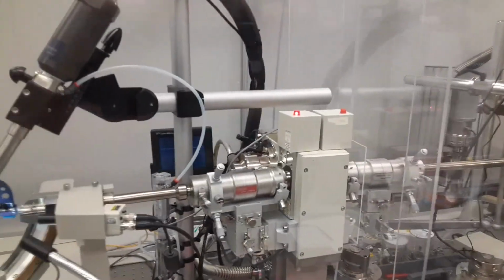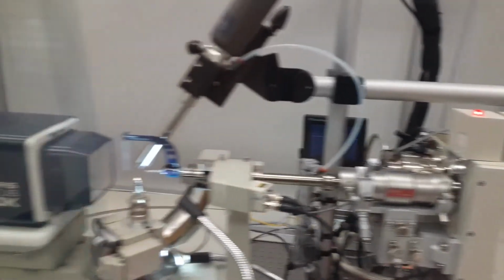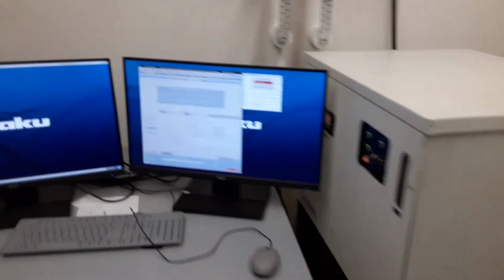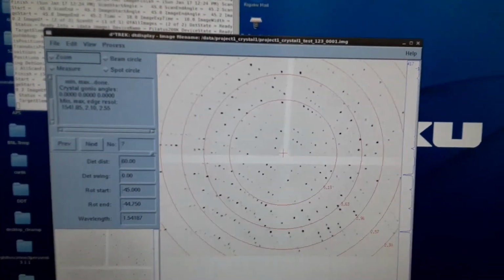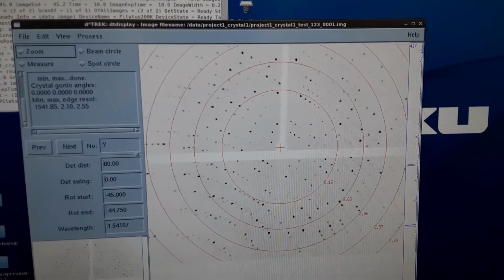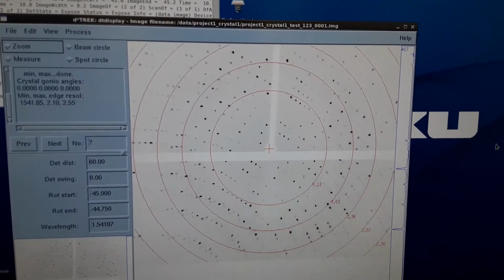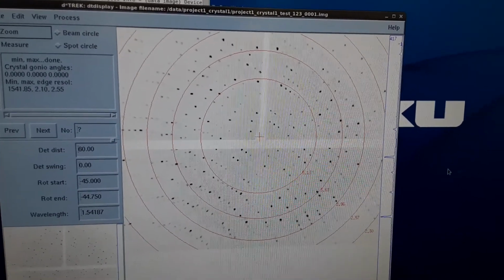And we can see here that that small red light just came on, and that indicates that the shutter's open. And the software knows that the shutter's open too. So our initial image just popped up here, and this is good diffraction. If this was your experiment, and this was your first image, you'd be extremely excited.